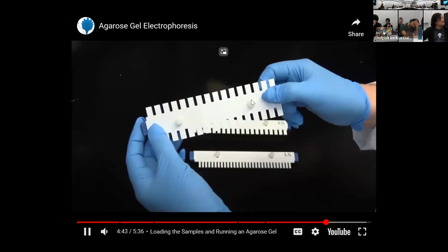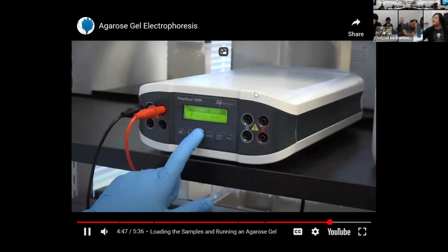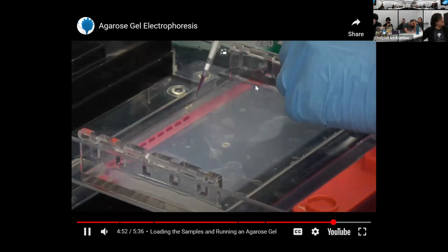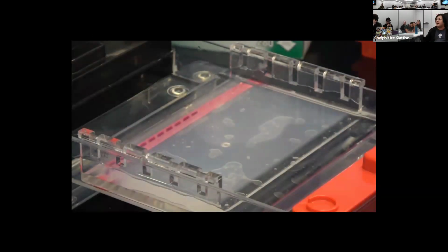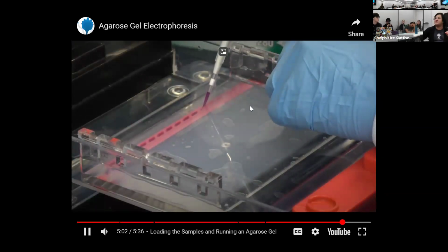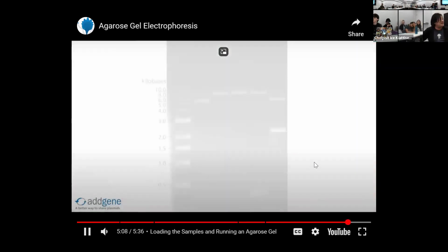You can use a gel comb. This is one of the groundbreaking technologies in gel running. Think about it: you want to put something into the well, and if you cast the gel without this comb, it's so hard to put the sample into the gel, right? And your bands will not be straight or easily distinguishable. So if you cast a gel and forgot the comb, don't try to poke the wells, just melt the gel again and put it back, or just add them.